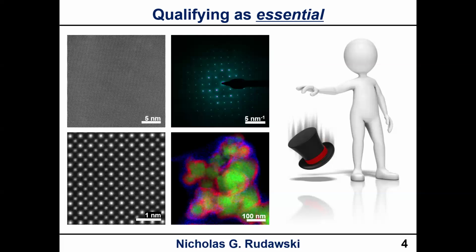Oh, and the last graphic, of course, is I need selected area diffraction work. Okay, I can do that now, right? That's what I qualify as essential. Something that you would be expected to be able to address on a day-to-day basis, and basically immediately.